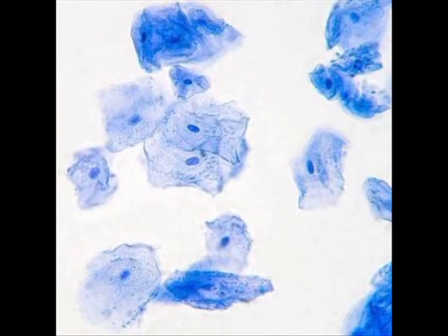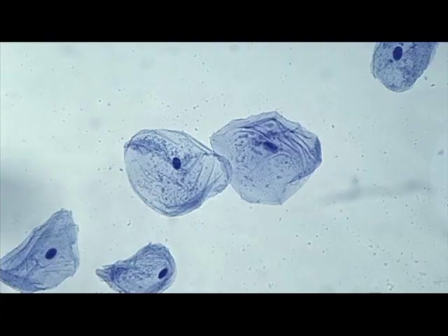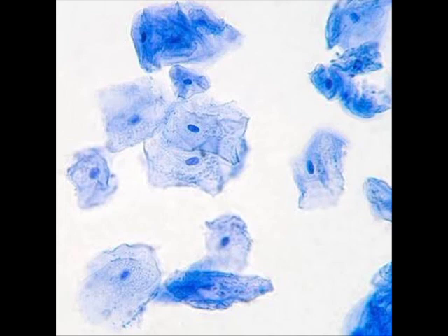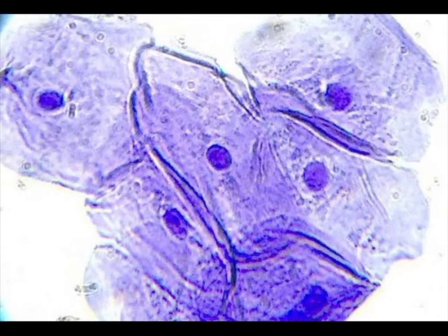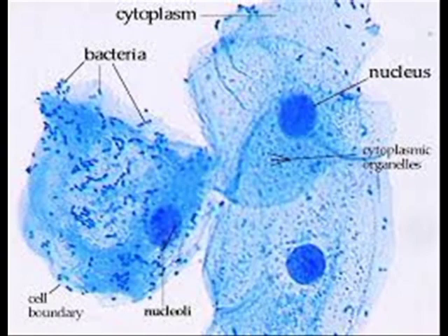Observe under the microscope and you will find a clear structure of human cheek cells. These cells are loosely packed together and irregular in shape. Animal cells are completely different from plant cells — you can see a free arrangement between the cells with intercellular space between them, arranged in an irregular manner.